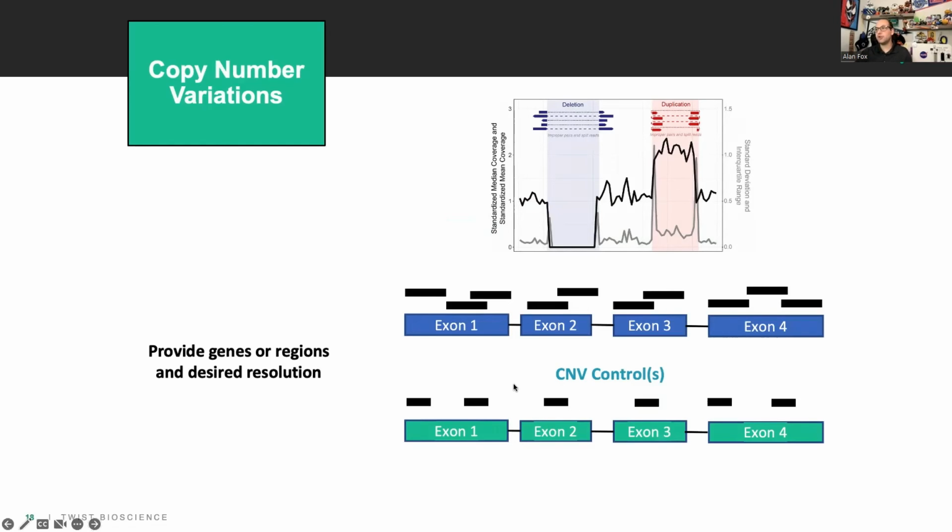But sometimes people want to look at copy number across a specific region or a specific chromosome, or all across the whole gene, not necessarily just the exonic level. Then we can space the probes evenly across the gene or region, and not worry as much about picking up mutations in the exons. So let us know. Anytime you have copy number, we can take both approaches. Most of the time, with an oncology hotspot panel, going with option one, our normal tiling and normal way of designing the probes, is perfectly fine, and then you just look across that gene of interest.